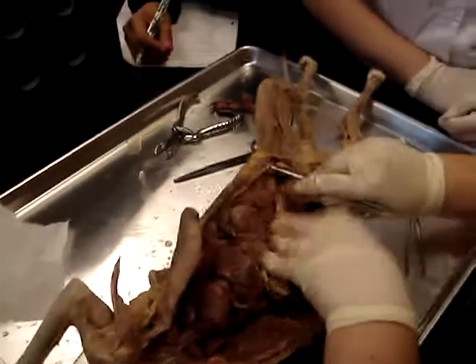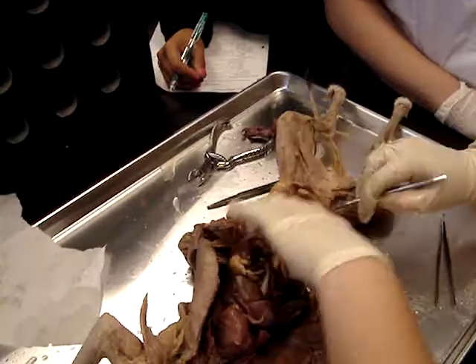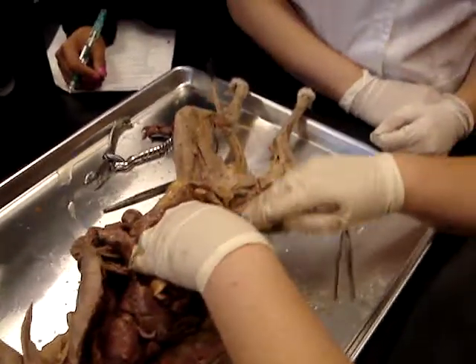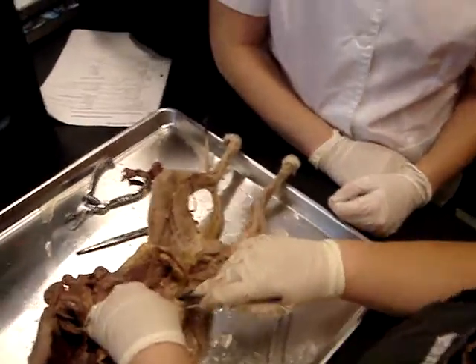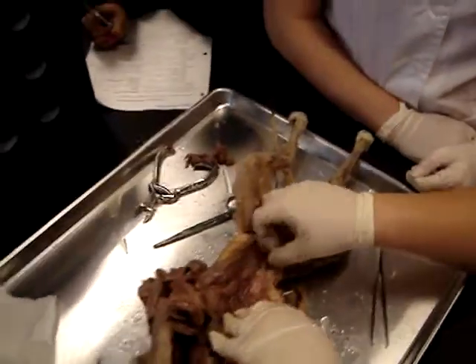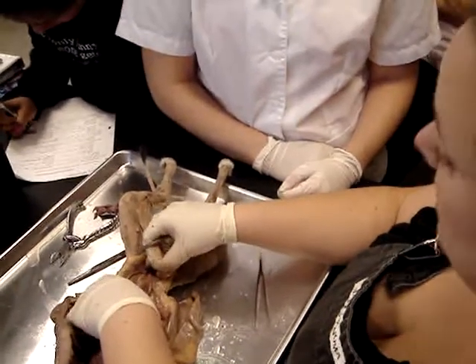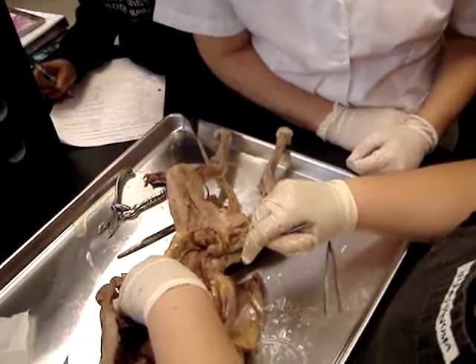So this is one uterine horn. This is her left uterine horn. And then this is her right uterine horn. Okay, so those are the two sides of her uterus. So here's the other side of her uterus. She does not have two uteruses. She has one uterus, but it has two sides. Okay, because their uterus is Y-shaped. So here's the left side and here's the right side of her uterus.